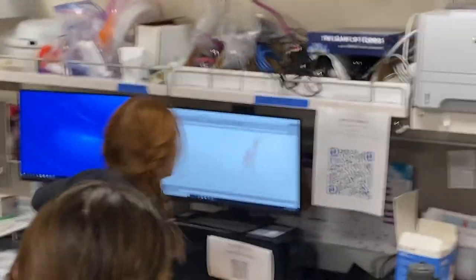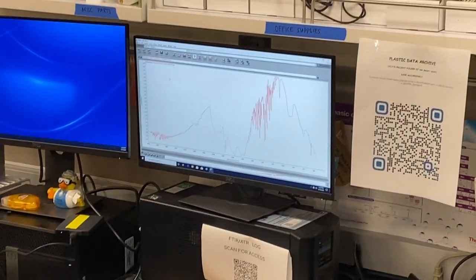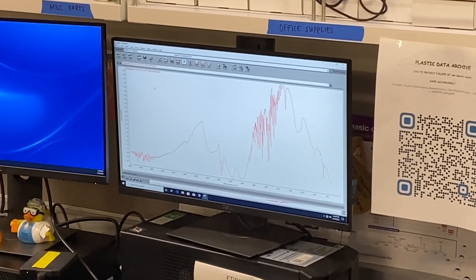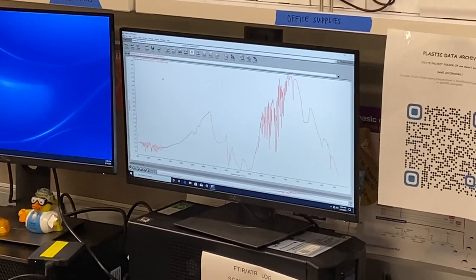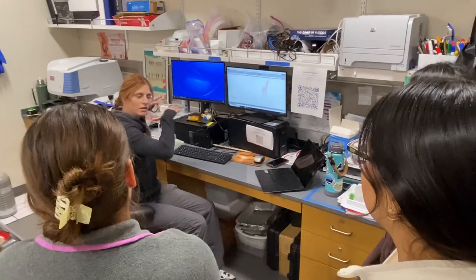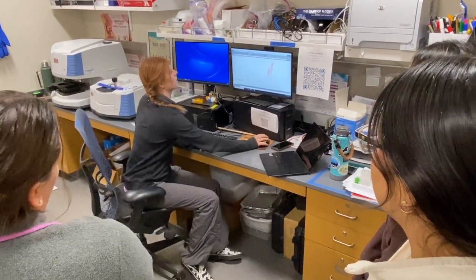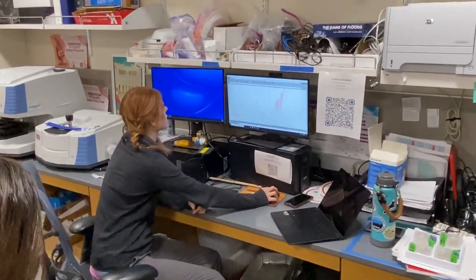We're going to come over here — I've already done a background. So what this does basically is, before we run a sample, we want to run a background, because it has to test what's going on in the air and what's going on around it, so it can measure your object a little bit better. It can kind of ignore the things it's already sensed in the background. So now we can collect our sample.